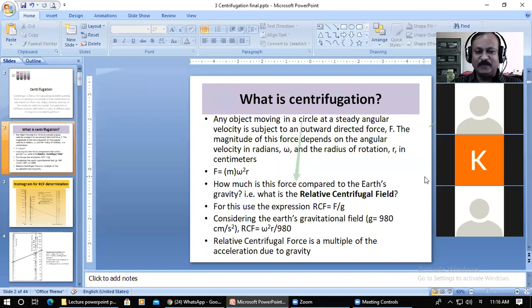Okay. So I think you have not worked with a fungal culture, or you have not compared a bacterial culture and a fungal culture. Mostly the fungi will tend to settle down at the base, but a bacterial culture will not settle down, because their size is too small and their mass is too less. Therefore, by simple gravitational force, they are not going to settle down. And that is why we have to use a centrifuge machine to allow the particles to sediment.